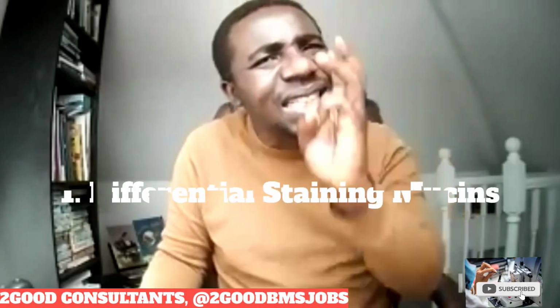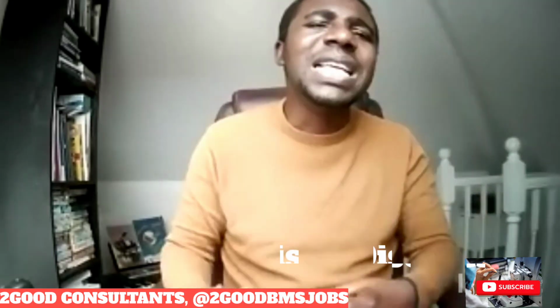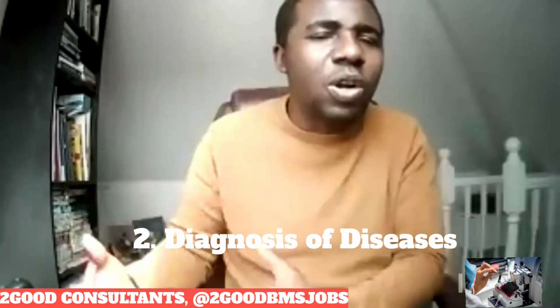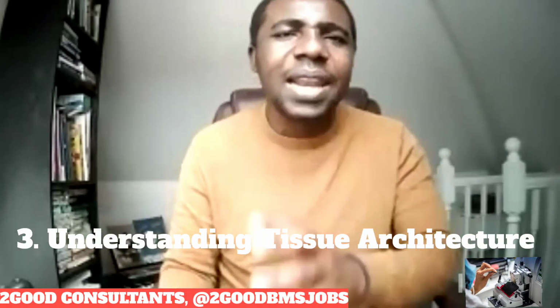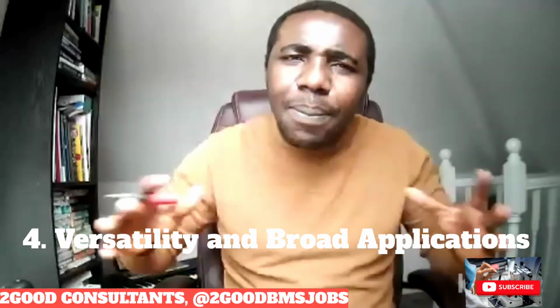ABPAS stain is important. So I have said number one, it acts as a differential staining technique that differentiates neutral mucin from acidic mucin. Number two, it can help to amplify the understanding of different conditions, hence helping in the diagnosis of diseases. Number three, it can also help to increase the understanding of the tissue architecture. And again, finally, it can be applied broadly, meaning that it can be used in different tissues and species, as the case may be. I hope that makes sense.